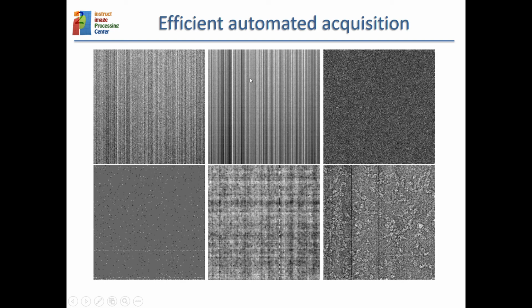And here you have, for instance, an estimation of the gain corresponding to this movie. We can see that it is a pretty good estimation. And here we have the residual gain, for instance. The residual is what remains when I have estimated this, or when I correct with the experimental image.